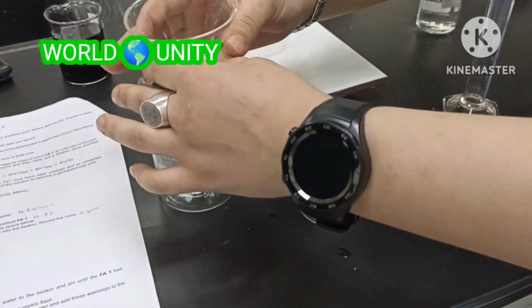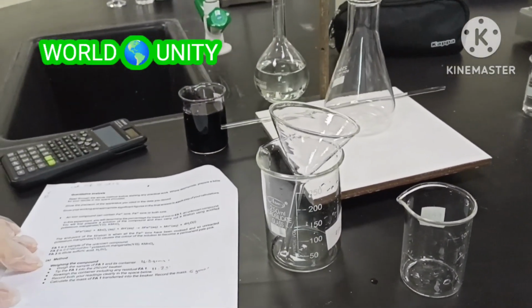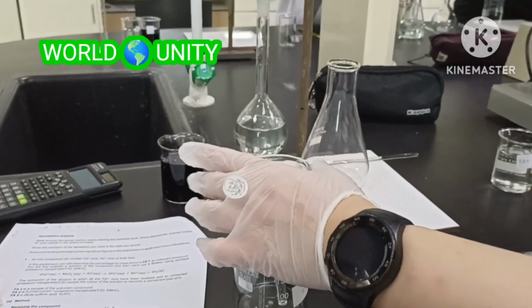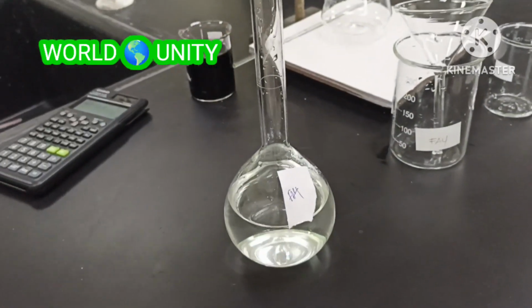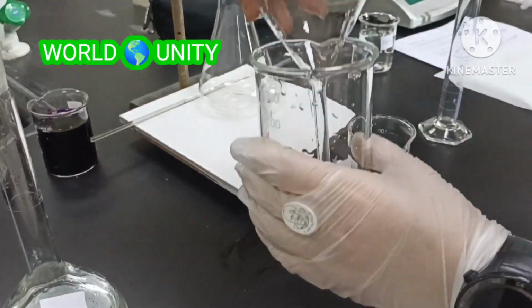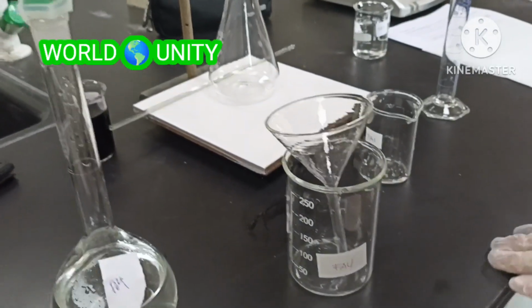Use gloves. Okay, put your gloves on. I just want you to protect your hands. Label. Now we're just waiting for the distilled water so we can rinse this, and it remains so until it's done.